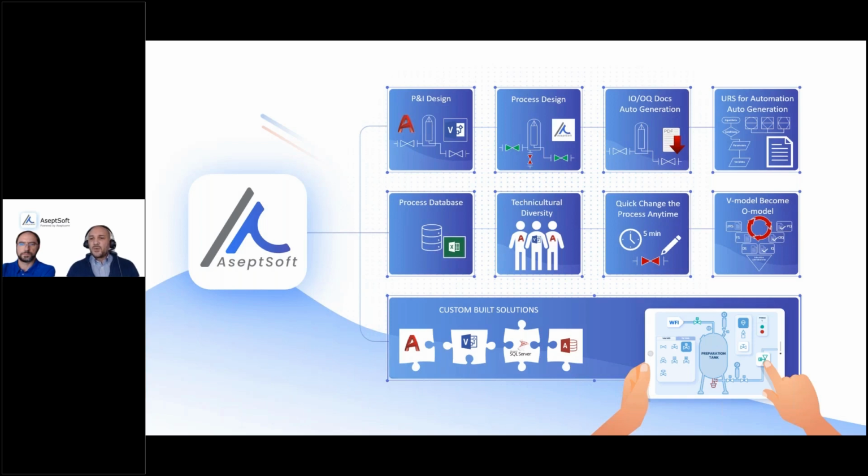Quick change of the process anytime, just in minutes. How the pharma documents V model becomes an O model. And we will speak also about custom solutions. Let's discuss all of this step by step.